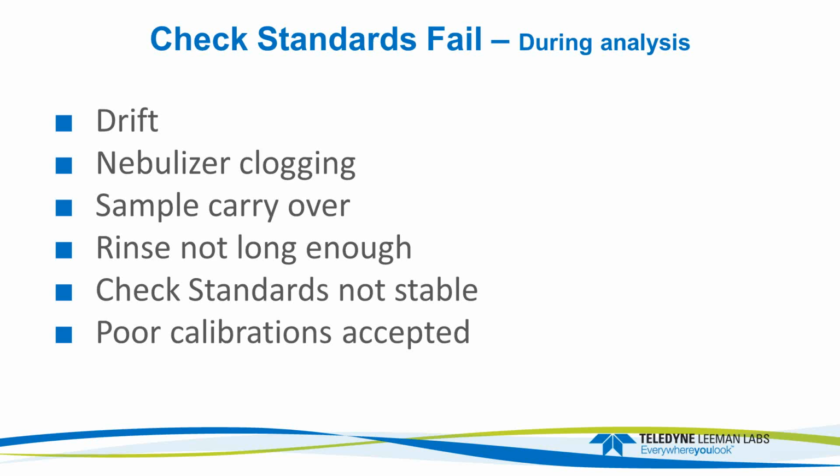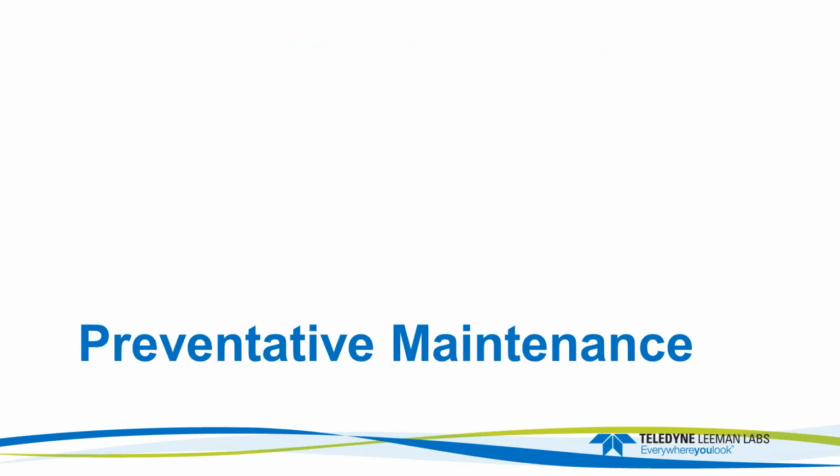Those poor calibrations really affect how well those check standards are going to do. You really want the best possible calibration. Your analysis isn't going to be any better than your calibrations are. Okay. All right. Preventative maintenance.